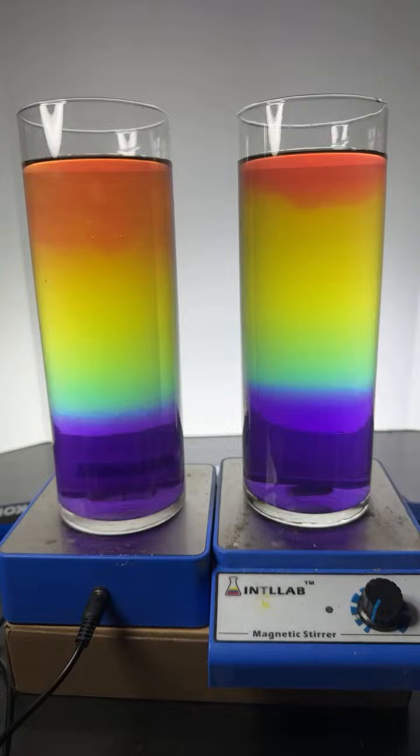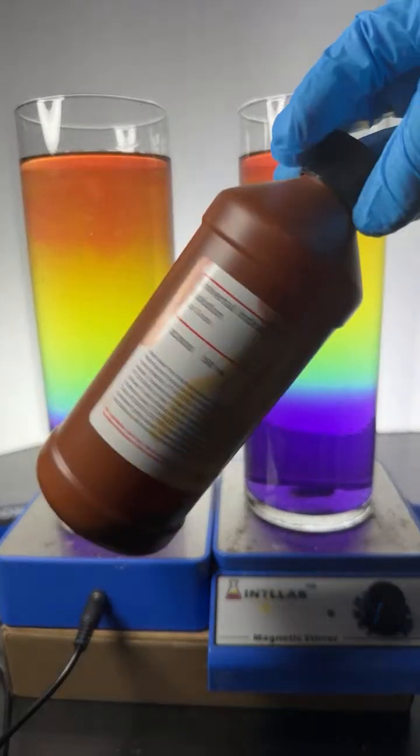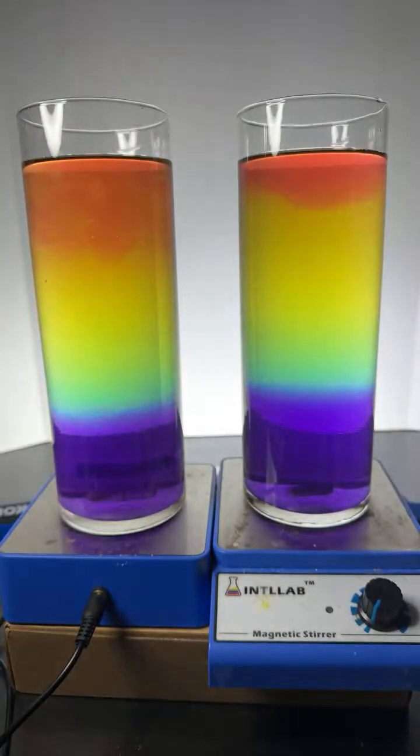What's in the solution? So Mohit, what's in the solution is universal indicator. It's also known as rainbow indicator. It's just a mixture of chemicals that changes color depending upon pH.